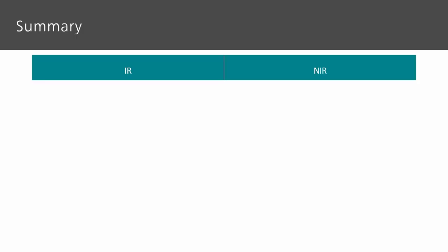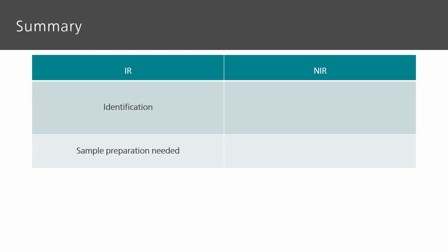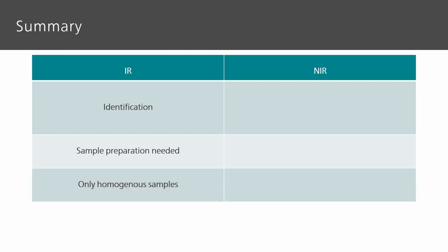To summarize, IR spectroscopy is well suited for the identification of substances. However, sample preparation is usually needed, which can be time-consuming. Also, the analysis of heterogeneous solid samples is a challenge for IR spectroscopy.